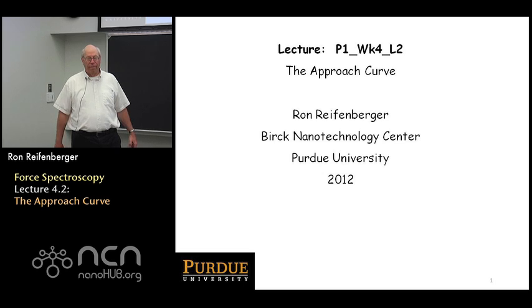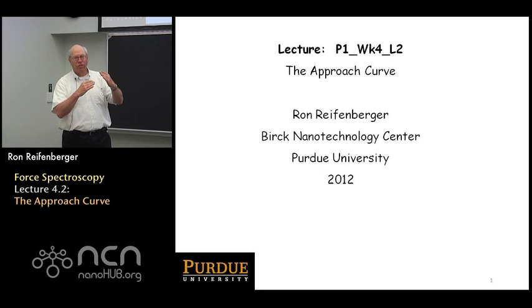Today we're here to talk about the approach curve, the physics behind what happens when a substrate is brought close to a cantilever, and when the cantilever has a tip on it and the tip interacts with the substrate. We'd like to try to systematically unravel all the effects that are going to happen when you just do this very simple experiment. And we're going to try to illustrate some of the important quantities that you might be able to derive by analyzing this so-called force versus displacement curve.